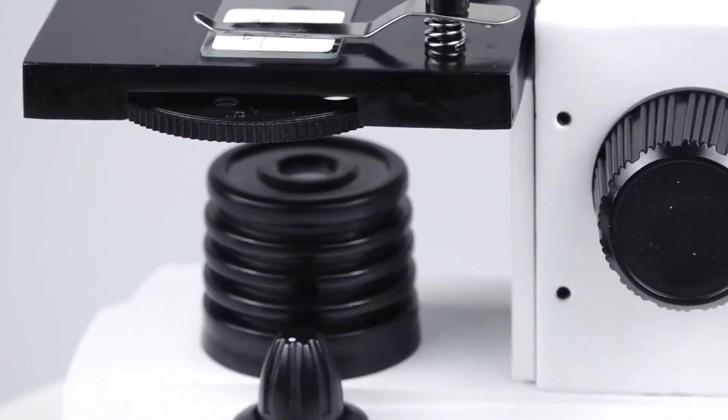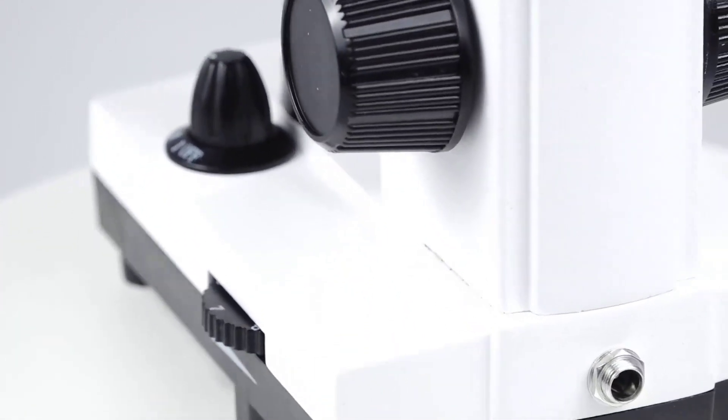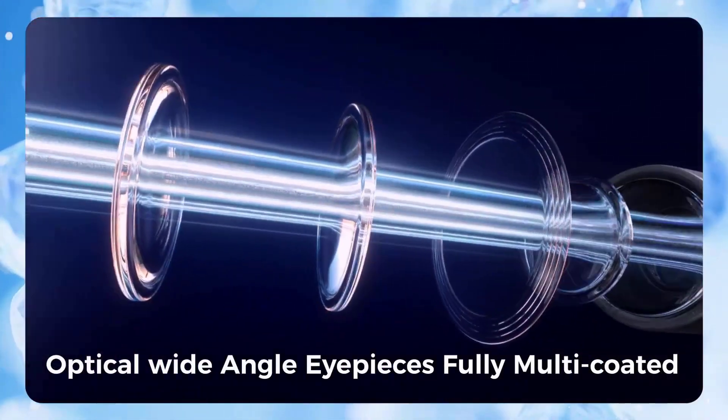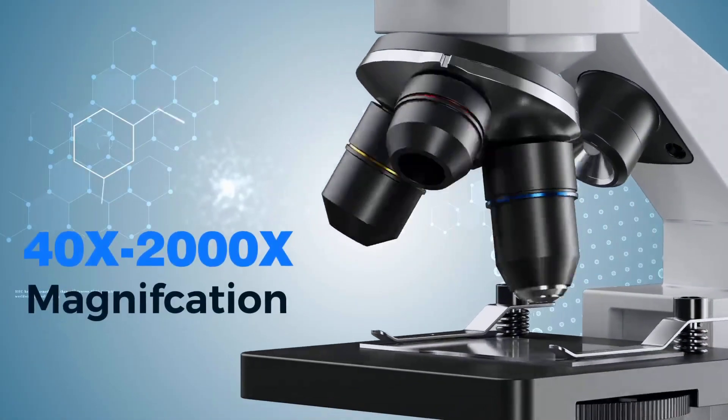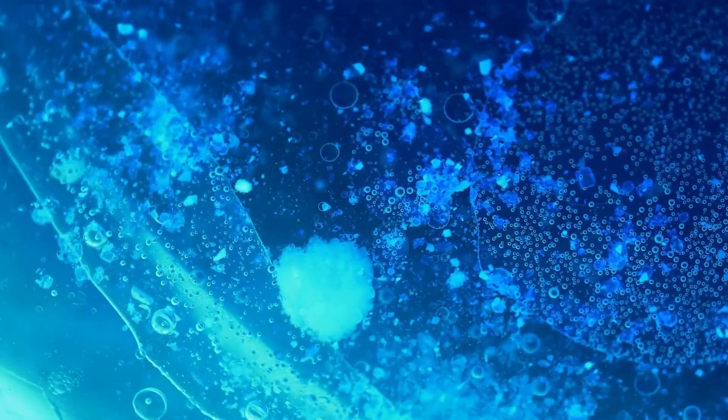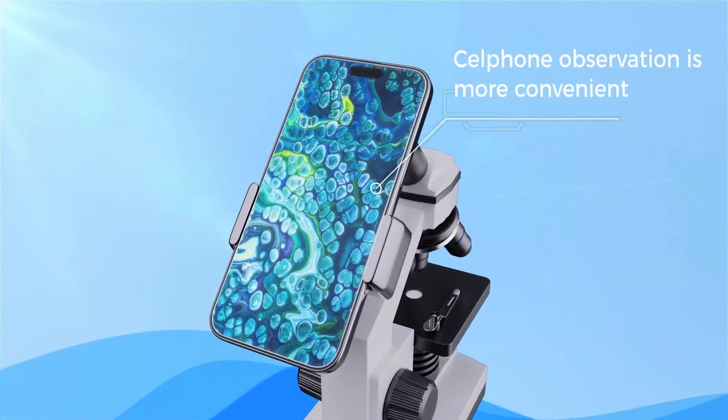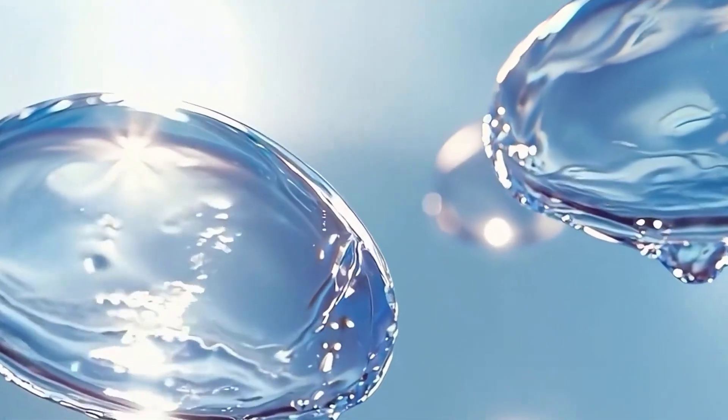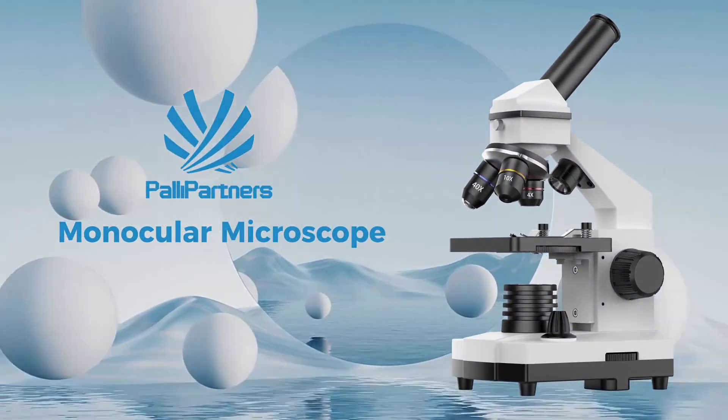As with many microscopes in this price range, the maximum 2000X magnification may not deliver the sharpest clarity, but the performance at lower magnification settings is remarkably clear and detailed. Given its competitive pricing, this minor limitation hardly detracts from its overall value. What truly sets this microscope apart is its comprehensive accessory bundle, including a protective carrying case and prepared slide collection. This complete package represents exceptional value for newcomers to microscopy.